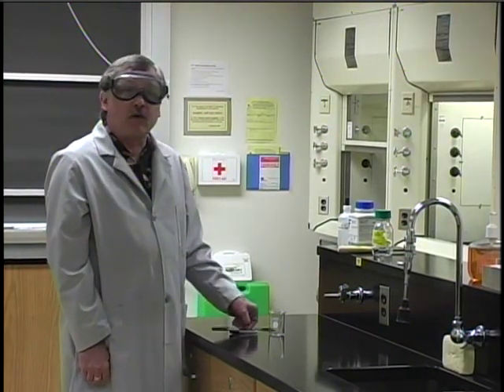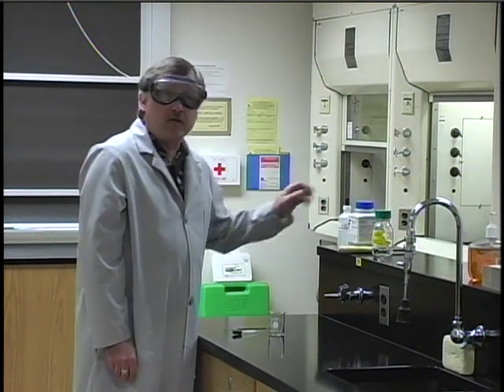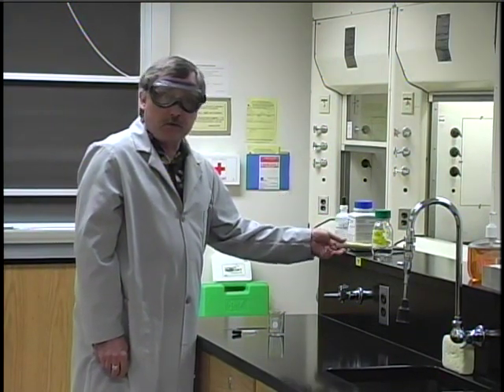Another way to prevent contamination is that you should never take equipment from your drawer — such as spatulas or droppers — and dip them into the stock reagent bottles. We will usually provide droppers for solutions with the bottle, or for solids we'll provide labeled scoops that you should use to dispense the chemicals.